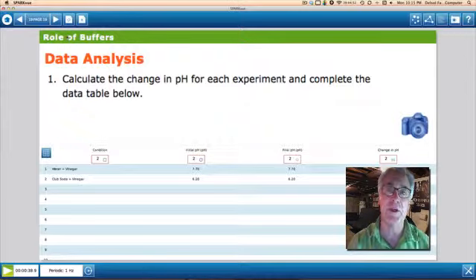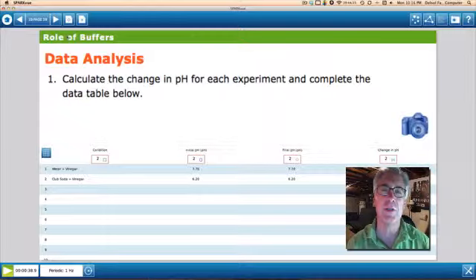So I hope this helps you in solving some of the mystery behind some of the software. If you need some more help, call me over. And hopefully with this, it should help you kind of smooth the way to make your lab much more comfortable.